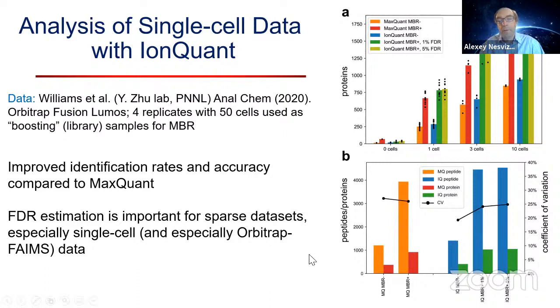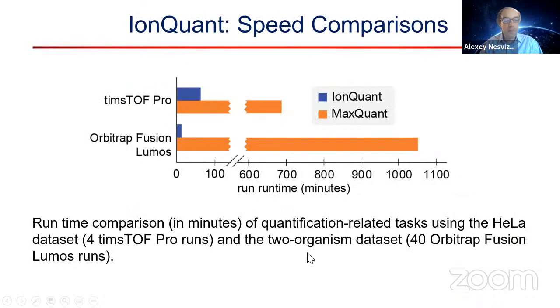So that's really great. But I do want to mention that, probably Max Planck people hate us for doing these comparisons, but the point for us is really to benchmark the tool. We're not developing our workflow to compete on the most standard analysis. We're not interested in that. We're developing our tools because we are driven by collaborators who tell us that existing tools are not applicable or too slow or not working well for those data sets. And we use the standard analysis and comparisons with other tools just to benchmark ourselves, because we need to know how well we are doing on standard analysis.